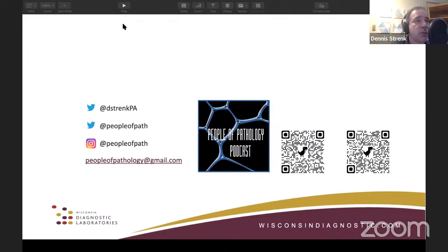The pancreatic neck margin is orange, the vascular groove is green, and then the SMA, or the uncinate or retroperitoneal margin, it's all the same thing, that's black. And then the anterior surface, again surface, not a margin, the anterior surface of the pancreas is blue, and the posterior surface is yellow.